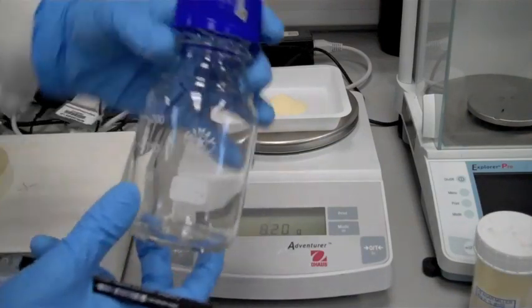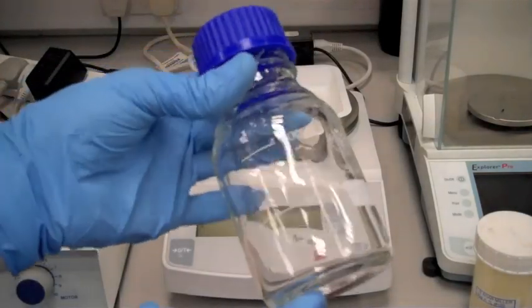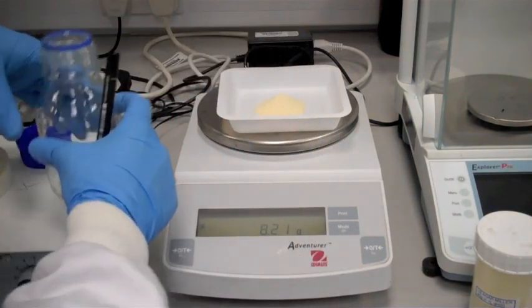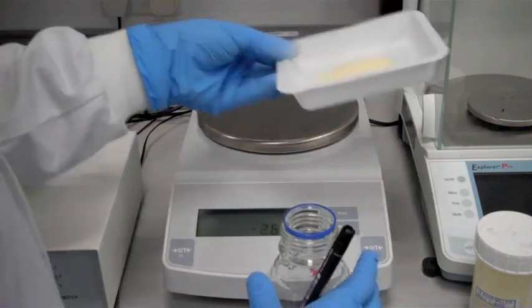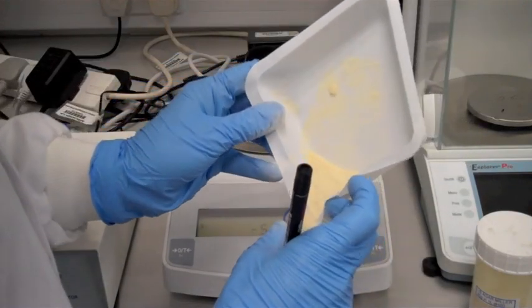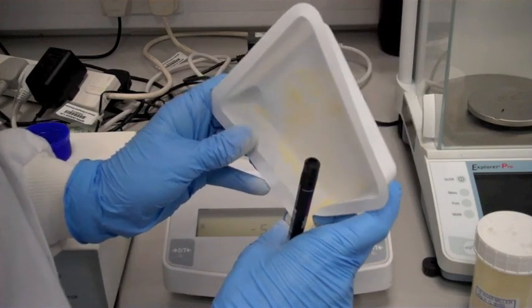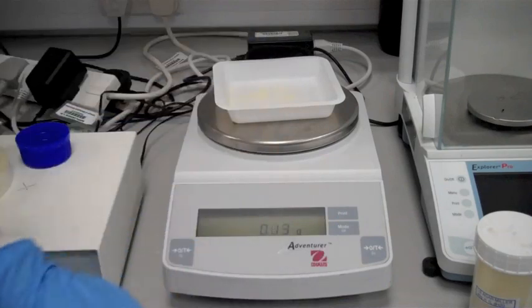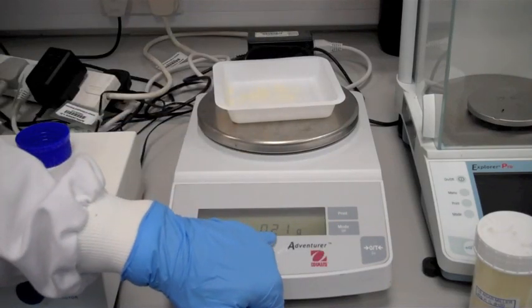Then take the bottle that you've been given, which will be for making your media in. Take the top off and simply transfer into the bottle. You'll notice that a little bit has been stuck still in there. If you actually put that down, you can actually see that that's 0.2 grams.